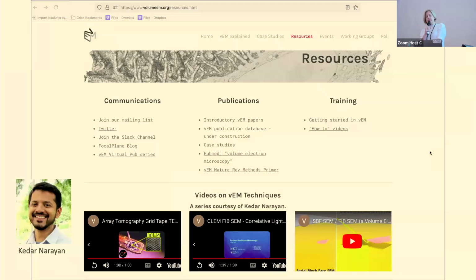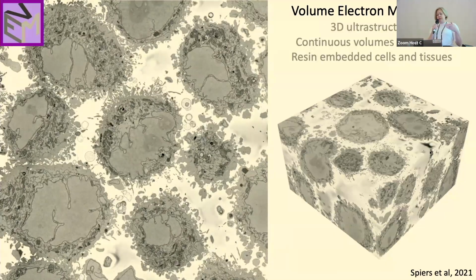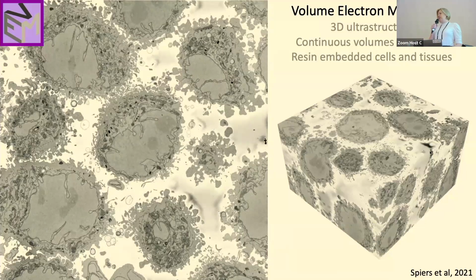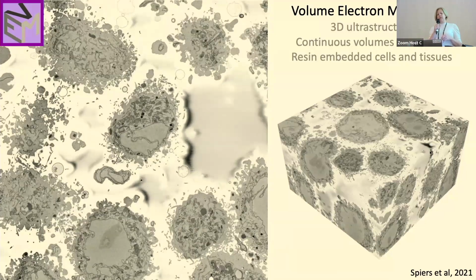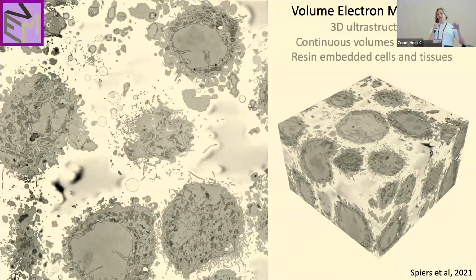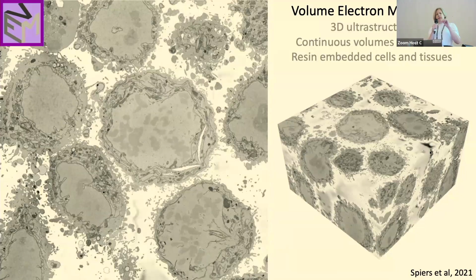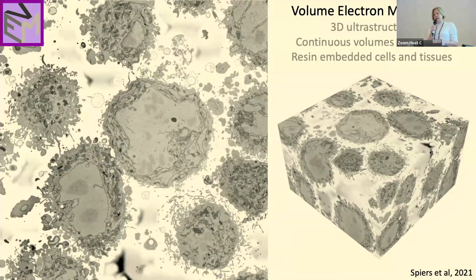If you'd like to use these videos in your talks, they're made by Kedar Narayan at NIH, and they're all available to use freely on the Volume EM website. The output of our work is these stacks of images which we can scroll through. For Volume EM, the community at the moment has defined VEM as continuous volumes greater than 1 micron, which differentiates us a little bit from the thin sections and the cryo-electron tomography field, but we hope to connect up across scales to work with them.